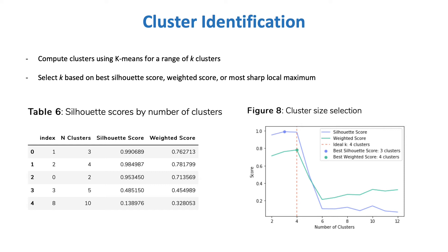Those two UMAP components are used to compute clusters using the k-means algorithm. Since k-means requires that we define k, the number of clusters, which we don't know upon loading the dataset, we try a range of values of k and analyze the quality of clusters for each value. The method used to ultimately select the ideal k is chosen by the user and may be one of: silhouette score, a modified large-k-prioritizing silhouette score to reward large numbers of clusters, or a "second derivative" method that identifies the sharpest local maximum of the score. As seen here, the ideal k based on the latter two methods is four, while the basic silhouette score would have selected k equals three.